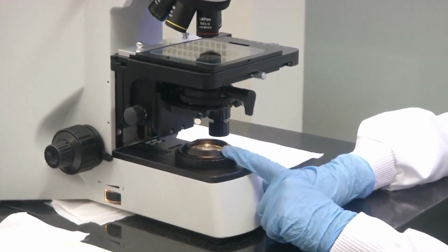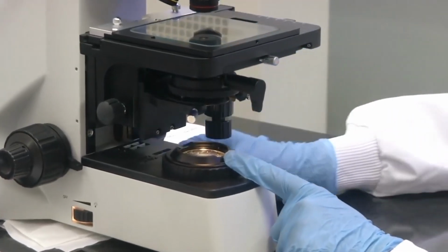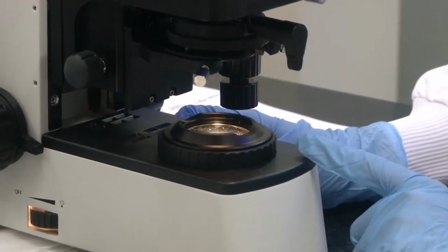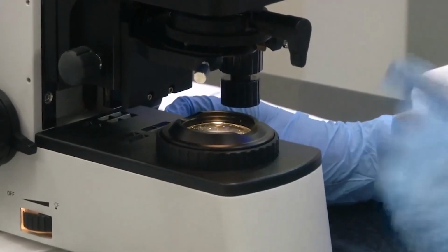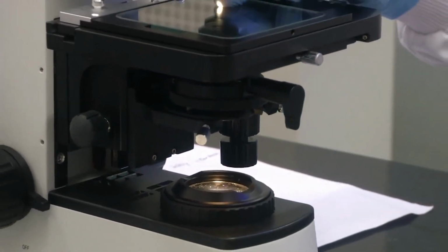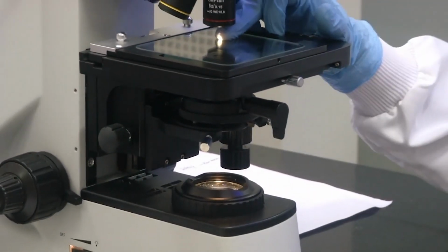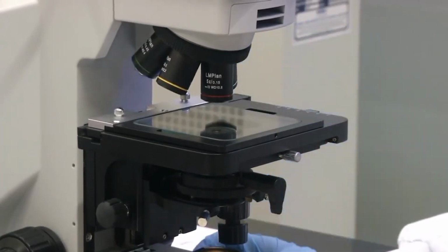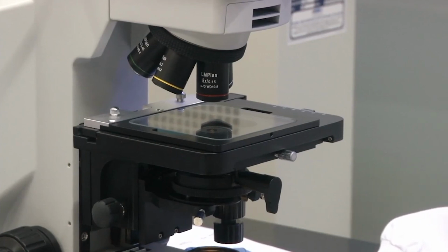This is the bottom light source. If I switch on the top light source, you might not be able to see it properly, but if you look at my hand, there is light coming from the top also. So these are the two illuminations in the metallurgical microscope.